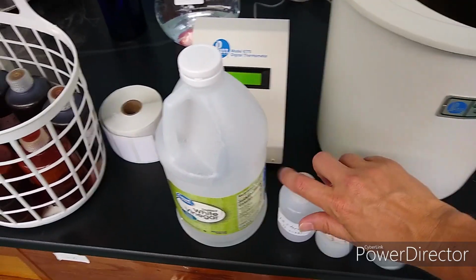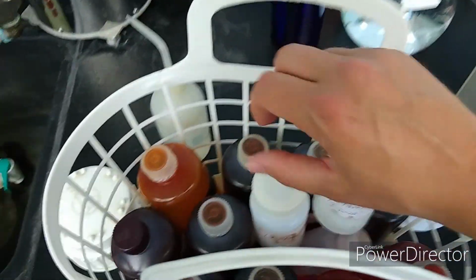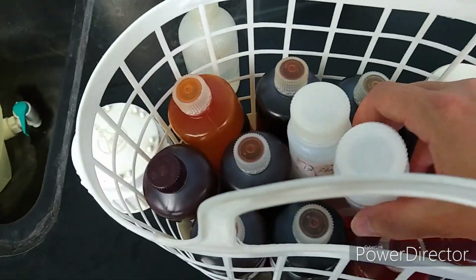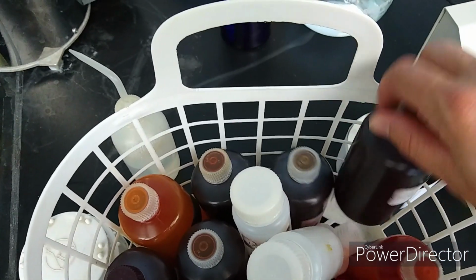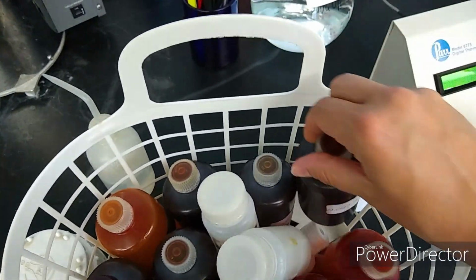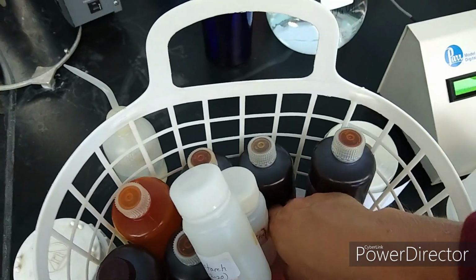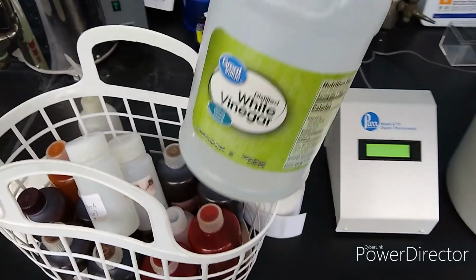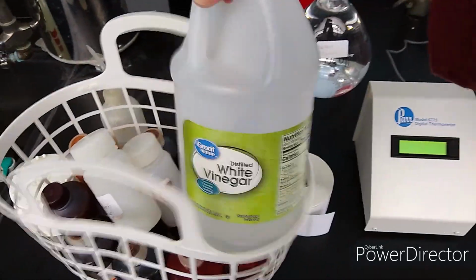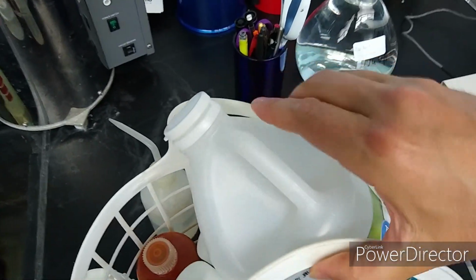We don't need very much of it, but I got the starch, and these dark colored bottles are the iodine bottles that I would use if I had a whole class of them. They got solution in them, but it's from last trimester, so several months old. So also need some vinegar or 5% acetic acid solution. Got that, so let's go see about setting this lab up then.